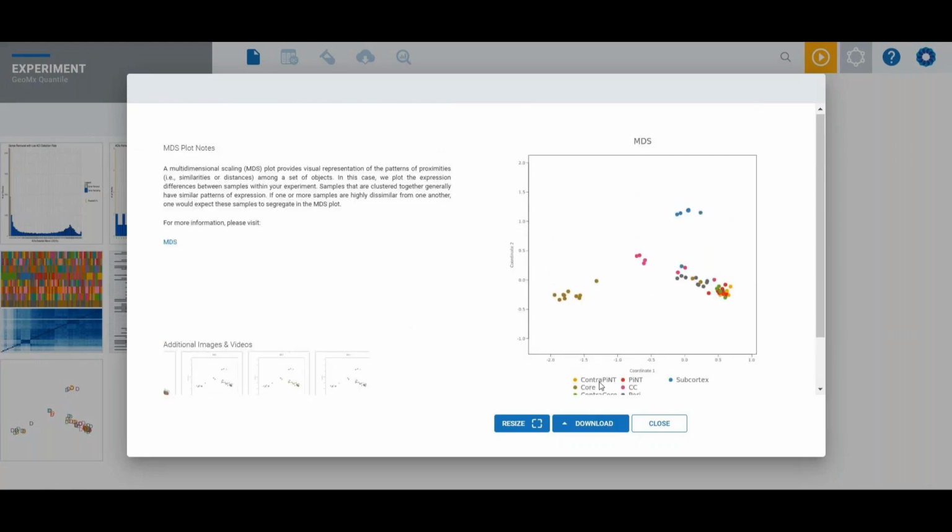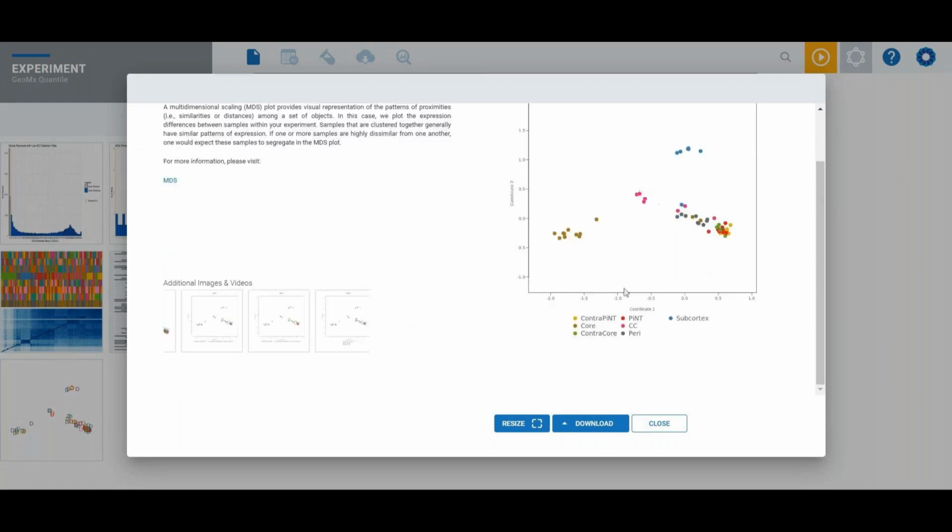What you can see here is that we actually have a high similarity between my core region. This is where the stroke occurred. And then our different regions here. We have the subcortex, so these are highly specific. We have specific cell types in each of these regions. And then we have a huge convergence of all these types after here.